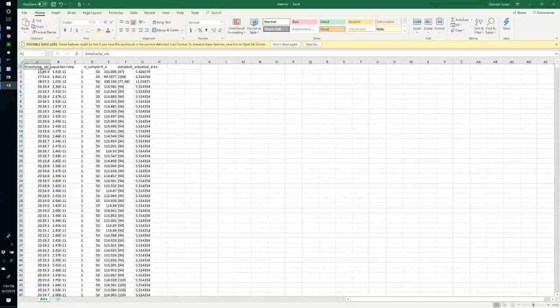This is a simple table that includes a column that's a timestamp in Greenwich Mean Time, and the second column is the capacitance measured. Then we also have the actuation voltage that was used on that step, and we have the channels that were actuated during this measurement, followed by the area that was actuated.